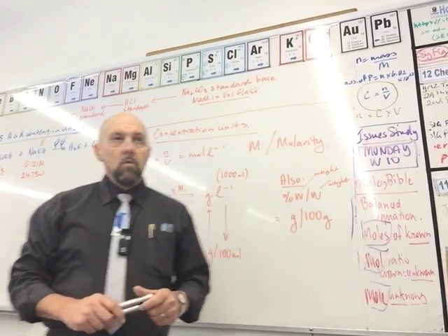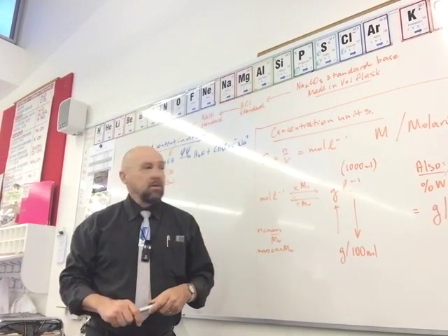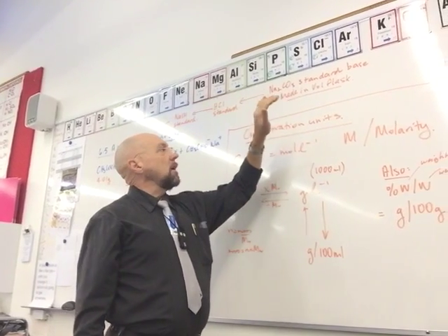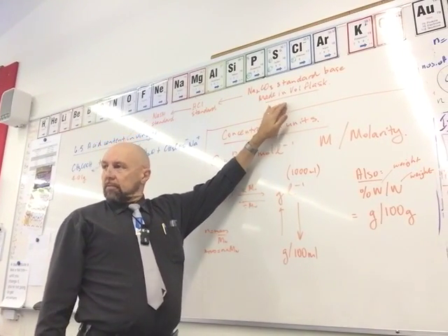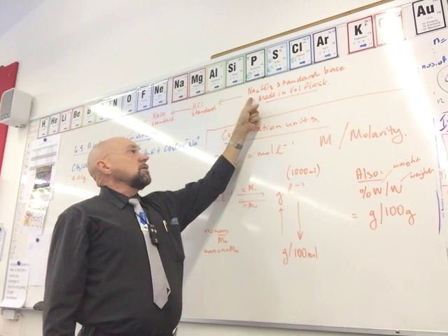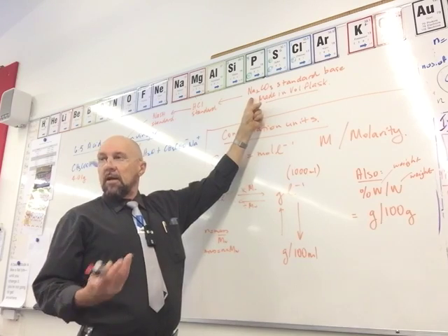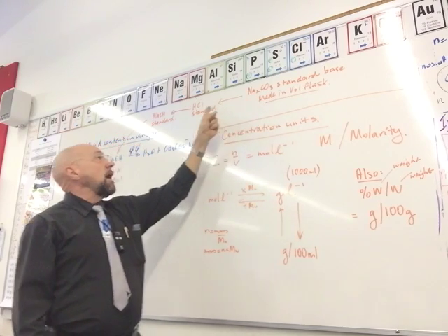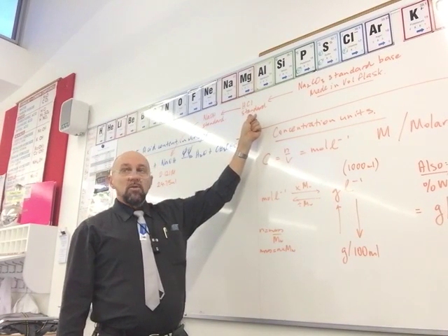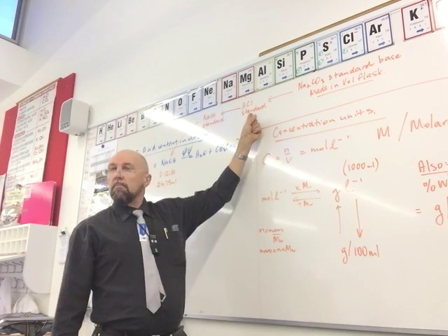Alright, so just to clarify where we're up to with our series of acid-base titrations. If you remember going back to the previous stuff that we recorded, we made up a standard solution of sodium carbonate. That was where we actually started. And we had to do that because we knew the sodium carbonate was pure. That was fine. We did that, made up our standard, and we used that standard to standardise the HCl that we were given. We were given an approximate concentration of HCl by the lab assistant, but we weren't quite sure.